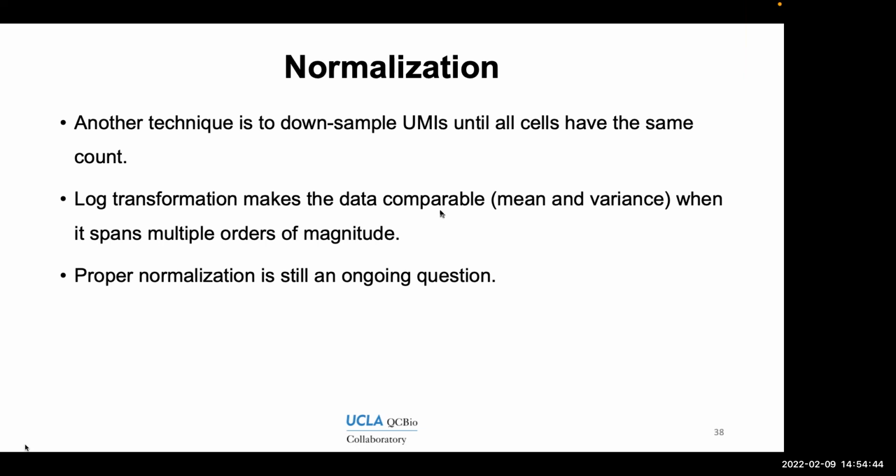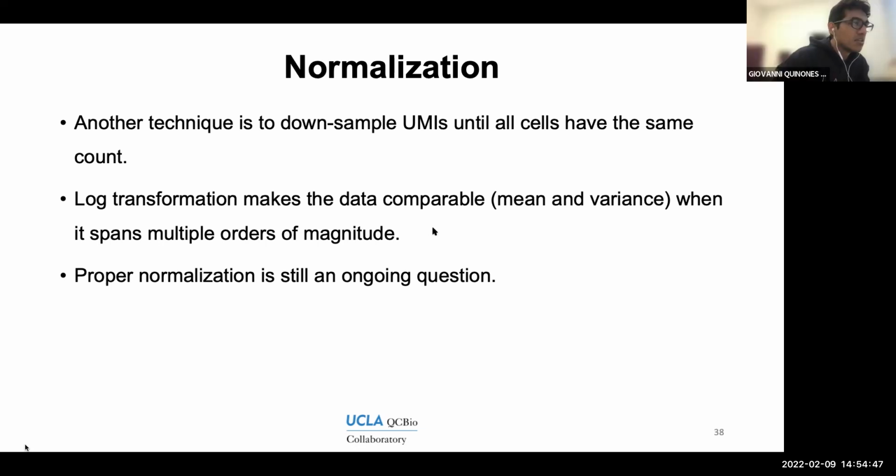And the other question, so the question is, what is the option for duplicates and triplicate samples versus control normalization? Normalizations across samples. So YJ, are you asking if, say, I obtain a tissue from patient 1, how to normalize in order to compare it to cells from a tissue from person 2 or something like that?